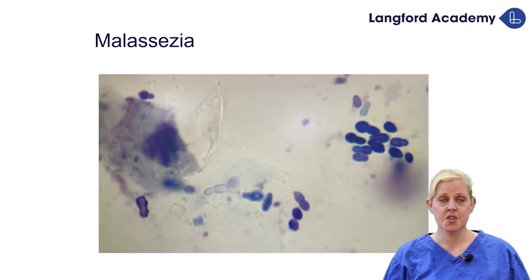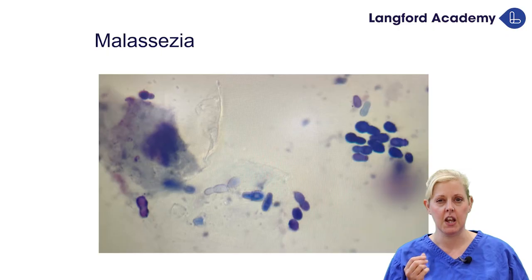The last slide I wanted to show you, so this is something called malassezia. These aren't bacteria or a blood cell. These are actually yeasts. They have a very distinctive smell. They smell like ears, if that makes any sense. Just that wet dog smell.